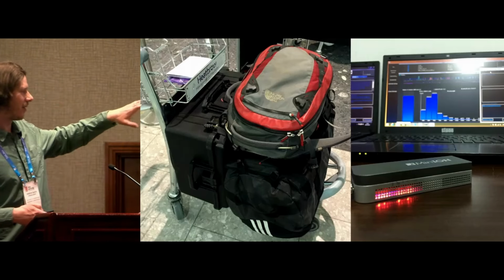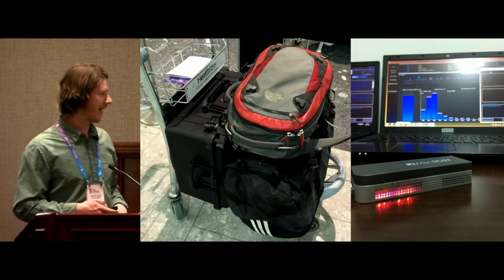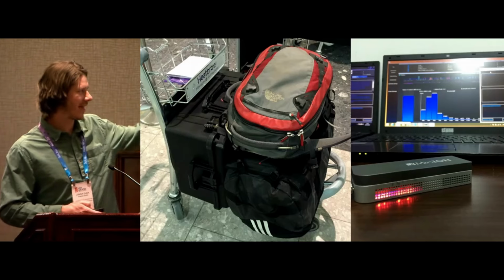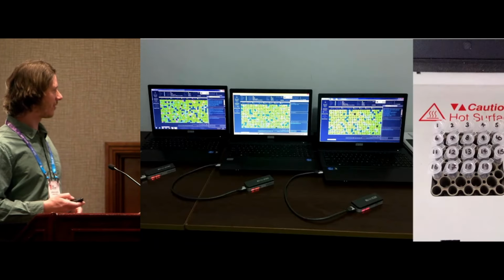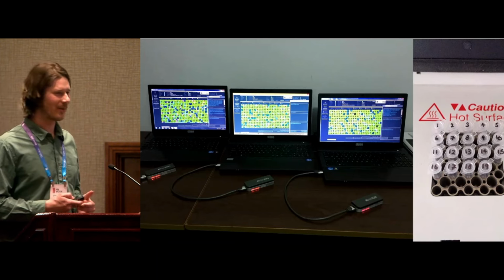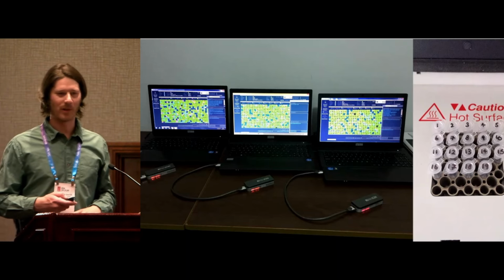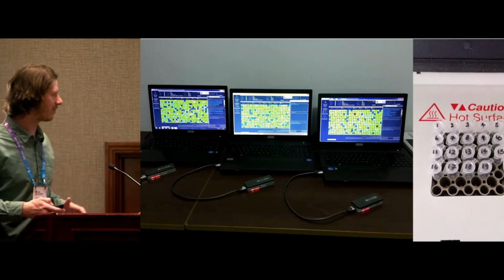You might have seen this picture before. That's the portable lab all packed up at Heathrow. And then on the right, that's the first sequencing run. And if you're a real OG, you might remember the Minnow display with that histogram, and that was one of the first ones. But look how amazing these flow cells were. These are some of the first runs that we did. The old Minnow displays had all 512 channels, and it was a sea of green on these runs. So these were obviously a really good batch of flow cells.